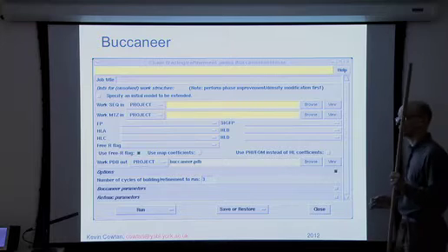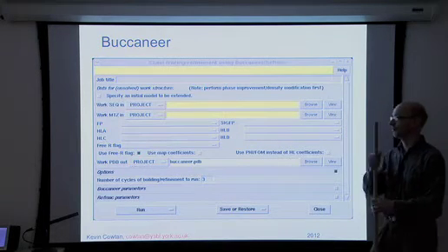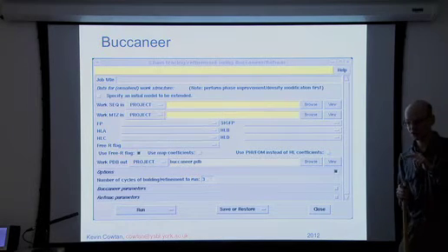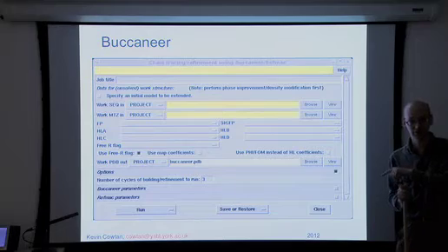Having said that, the methods are significantly complementary. ArpWarp in particular is stronger at higher resolution, but weaker at lower resolution. So if you've got good resolution, lousy phases, then ArpWarp is more likely to work. Poor resolution, better phases, Buccaneer is likely to work. They're both automatic, so try them both.